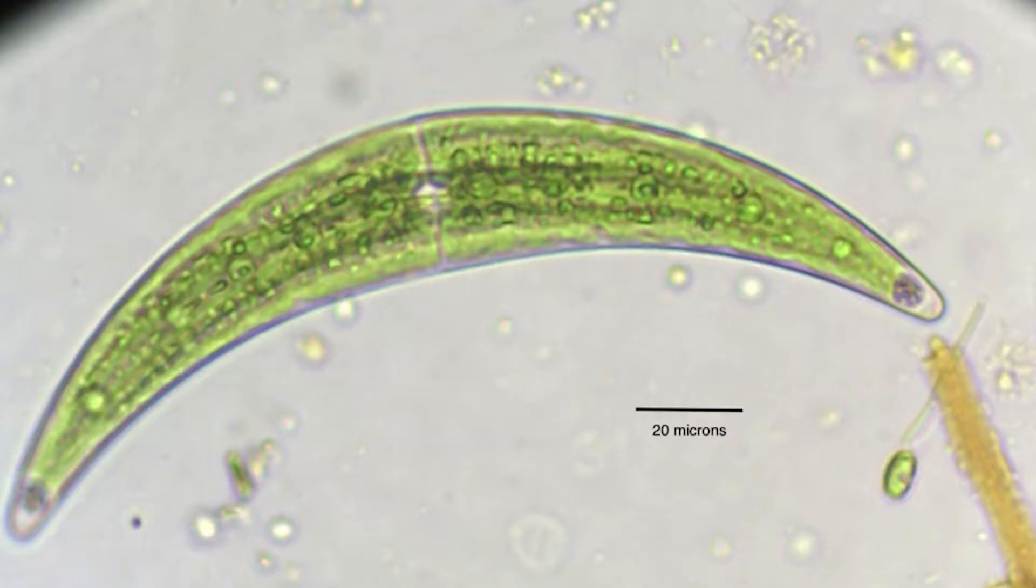In Closterium, the crystals are found in small vacuoles at the edges of the organism. So I recently found a specimen of Closterium in a pond sample, and I had to look.